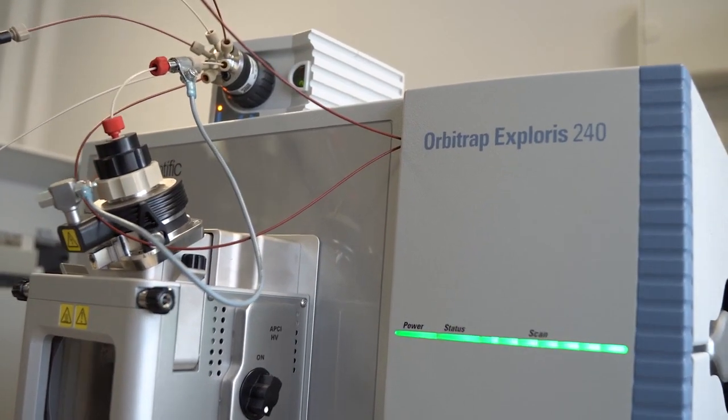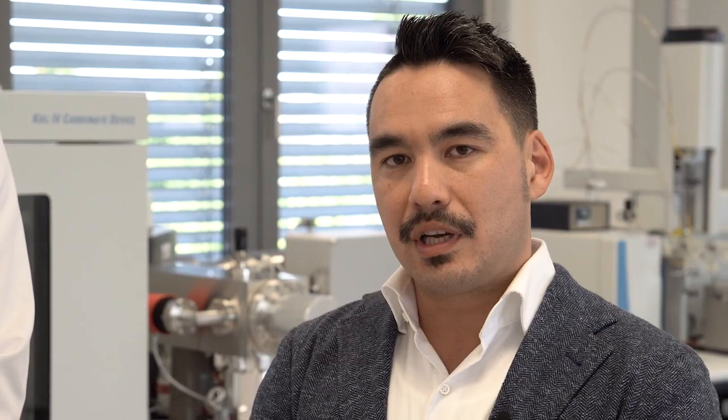It's called the Thermo Scientific Orbitrap Exploris Isotope Solutions and it's based on Thermo Scientific Orbitrap technology. I'm going to hand it over to Nils to go a bit into the technical details of the offering.